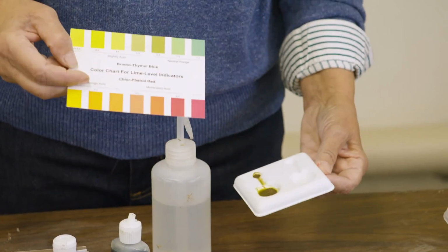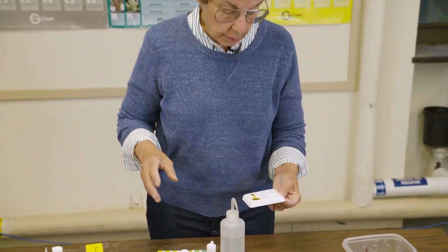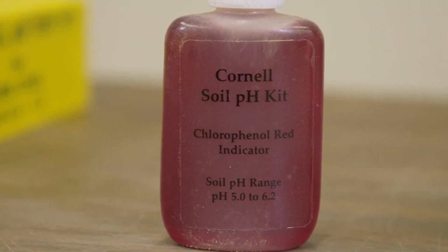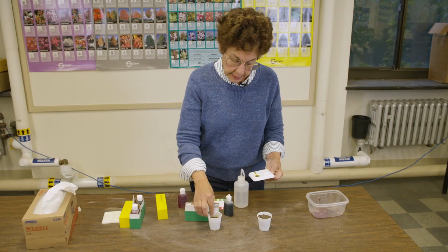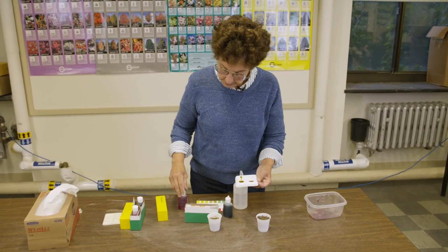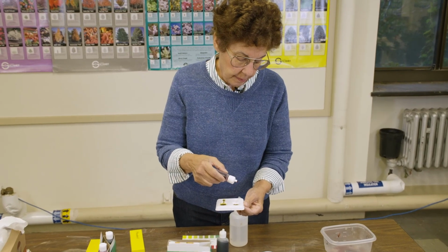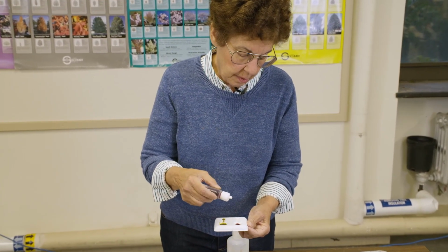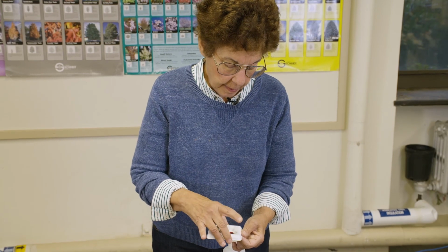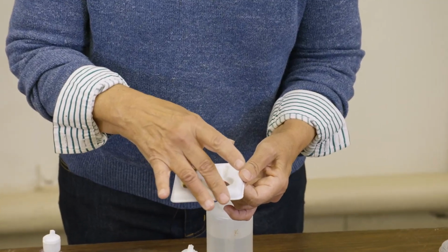Okay, so if we're at one end of the color chart, we want to go further because we may not see exactly what the final pH would be. So in this case, we'll use another reagent in the kit, which goes from pH 5 to 6.2. It's at the lower end. So we take another bit of soil from our sample, put it in the other bowl, and using chlorophenol red, we're going to wet the sample. And mix it by tapping it so that the solution bathes the soil in the cup.